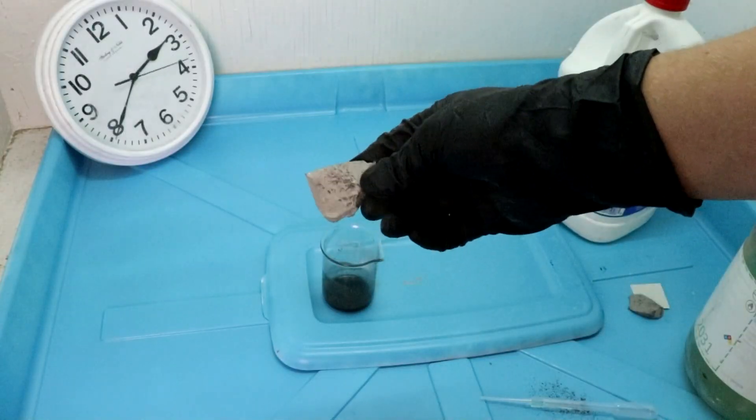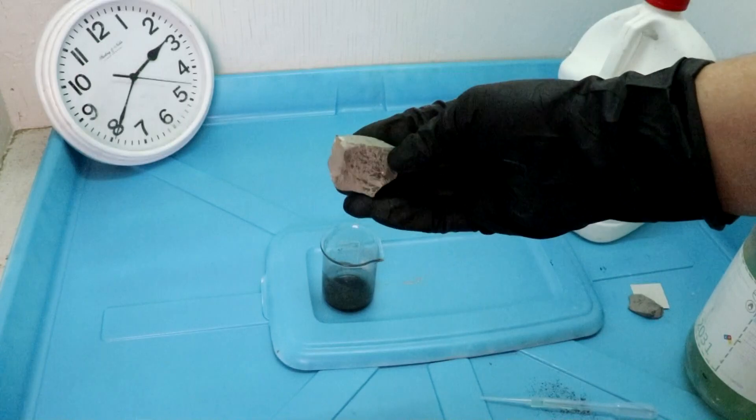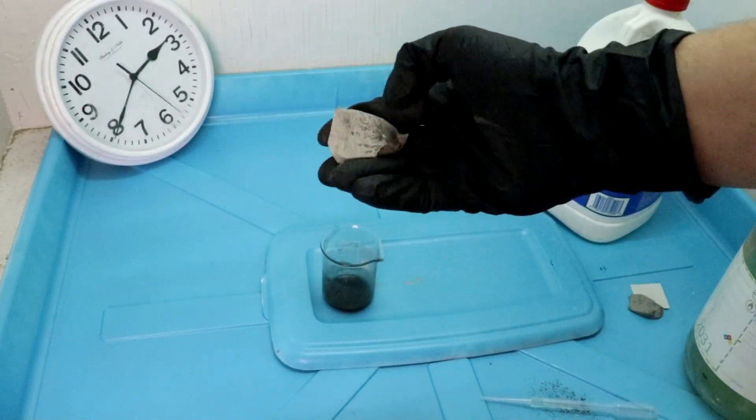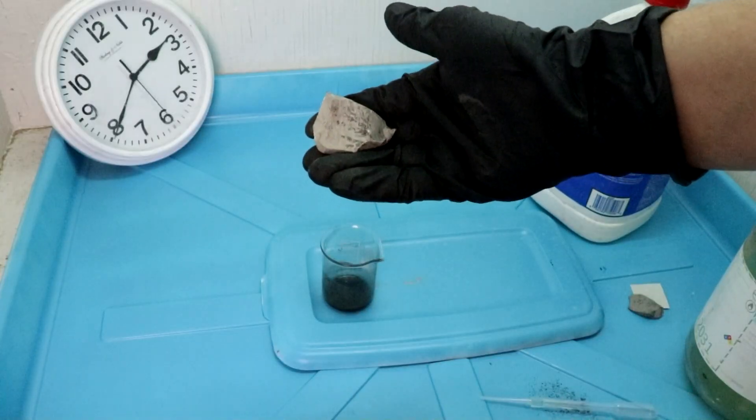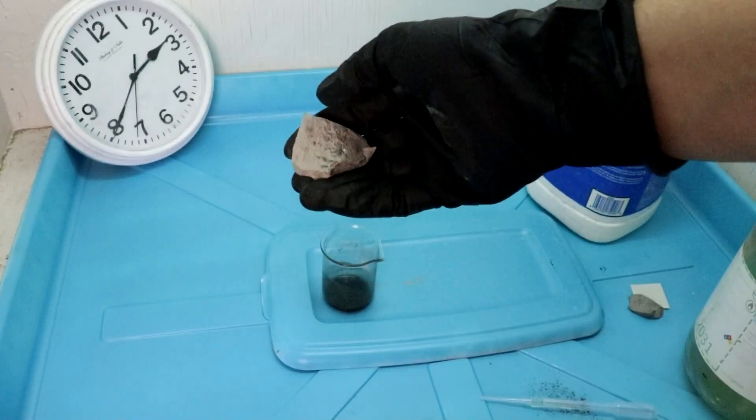Now there are many ways to combat this. One way I found is to roast the ore at high temperature, maybe 500 degrees Celsius, for a few hours. That will break down the manganese dioxide into other oxides which are not quite as oxidative.